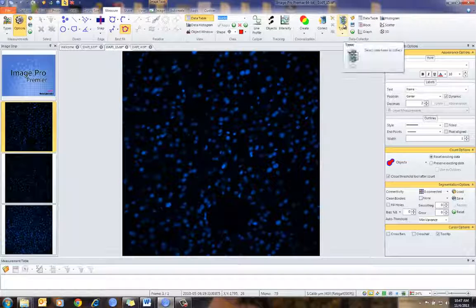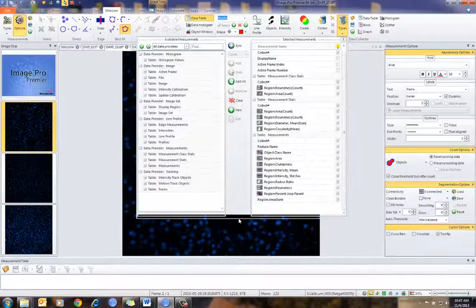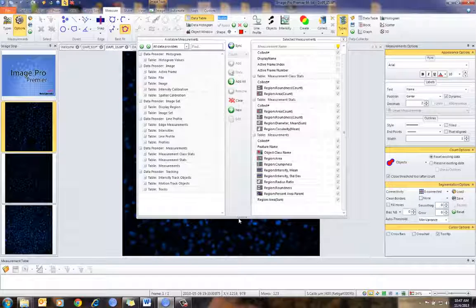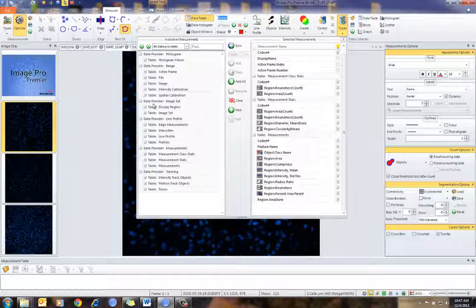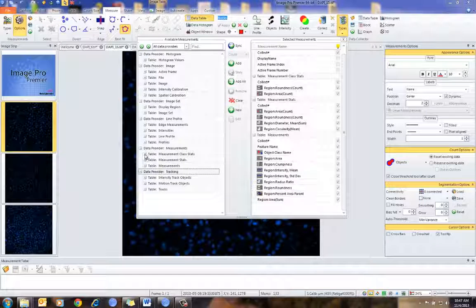The most important thing about Data Collector is setting it up and telling it what information to accumulate. We can accumulate data from a variety of sources, from all the measurement features, and also from the image. On the left side is an example of all the data that we can keep track of.